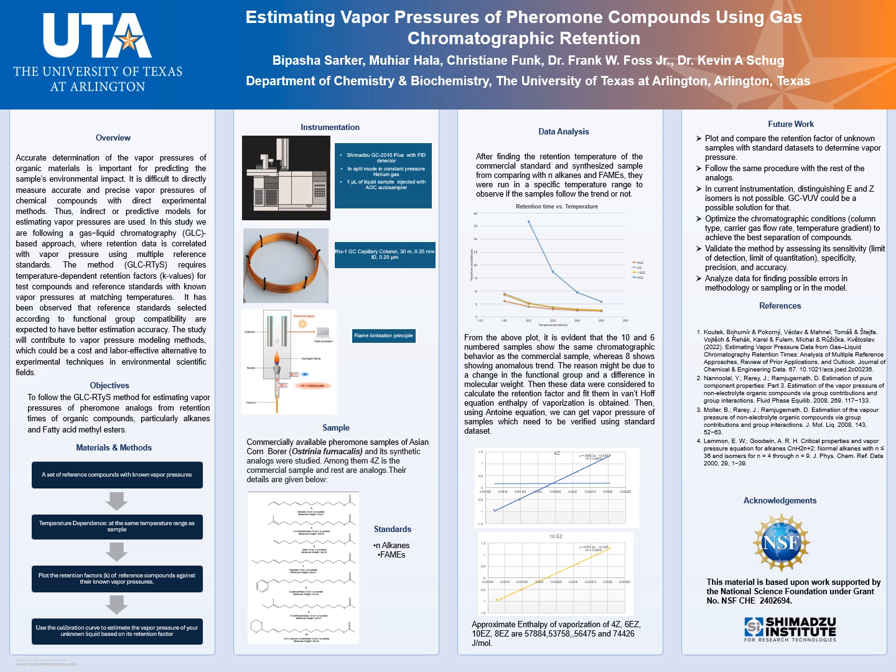In this case, we can rely on indirect methods, but the use of standard data sets is crucial in this method, and many previous studies have tried to follow gas liquid chromatographic retention, but our method's difference is we are using multiple standard reference methods.